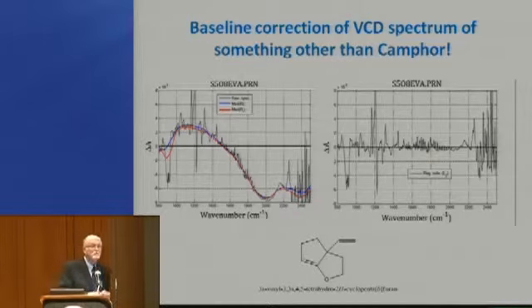So this seems to be a technique that works with unipolar bands, bands going in one direction, bipolar bands, noisy or not noisy, spikes or no spikes, and to a relatively limited extent, solvent bands, even, which are the most difficult things to compensate because they're not really baseline.